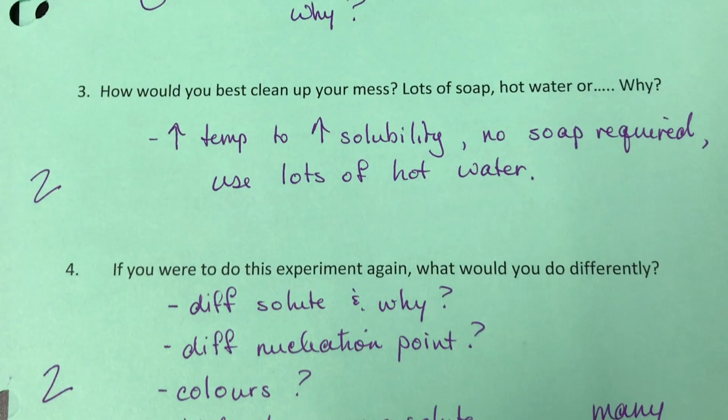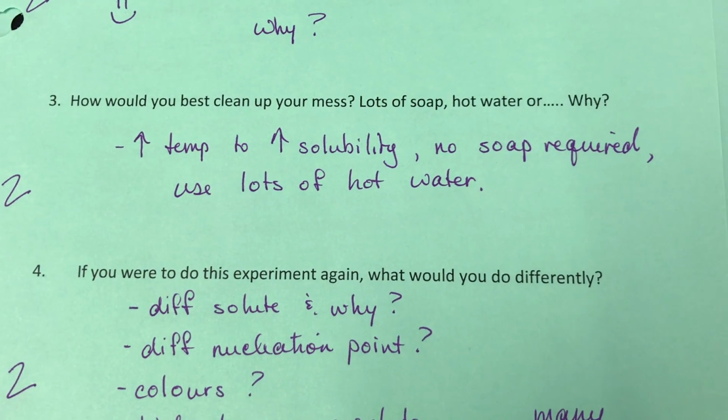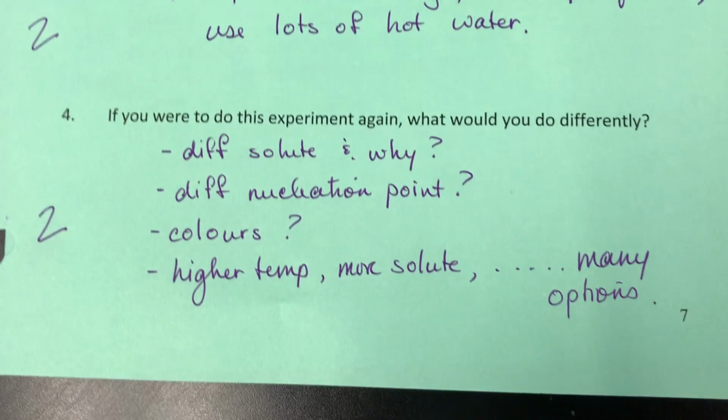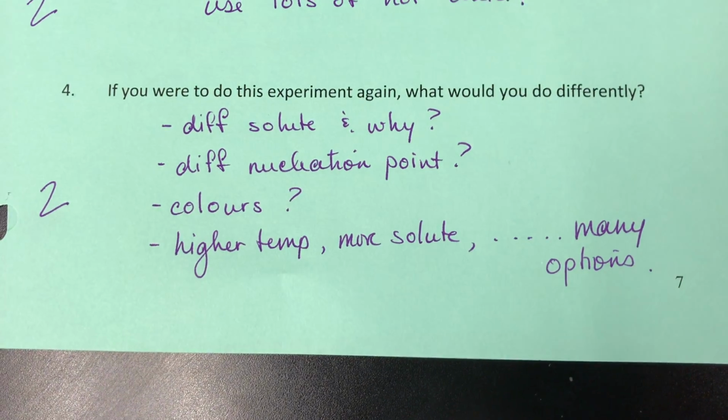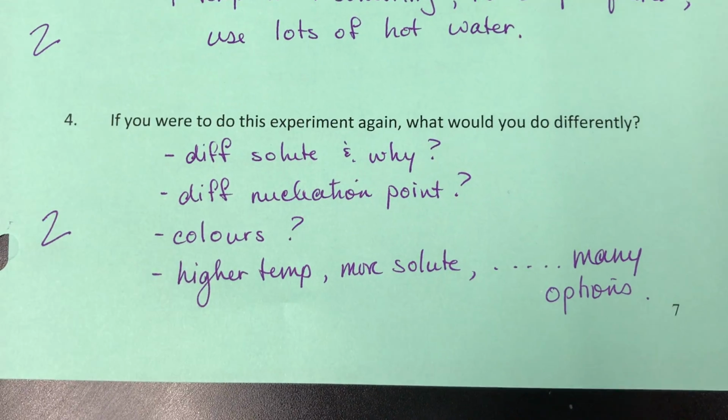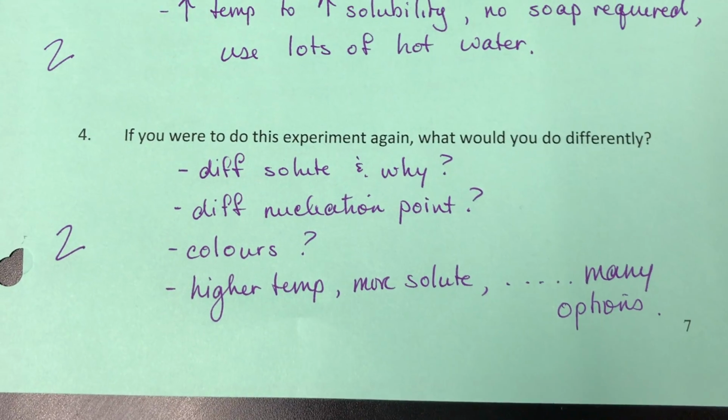The answer in cleaning this stuff up, which I had sugar all over everything in the lab, and I used that. And then also as a last one, if you were to do it again, what would you do differently and why? And there's lots of options about what might be different to get better results in this lab.